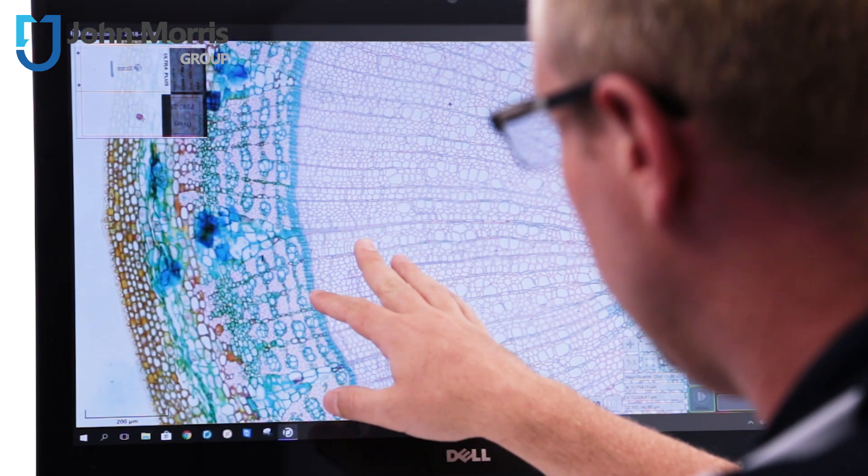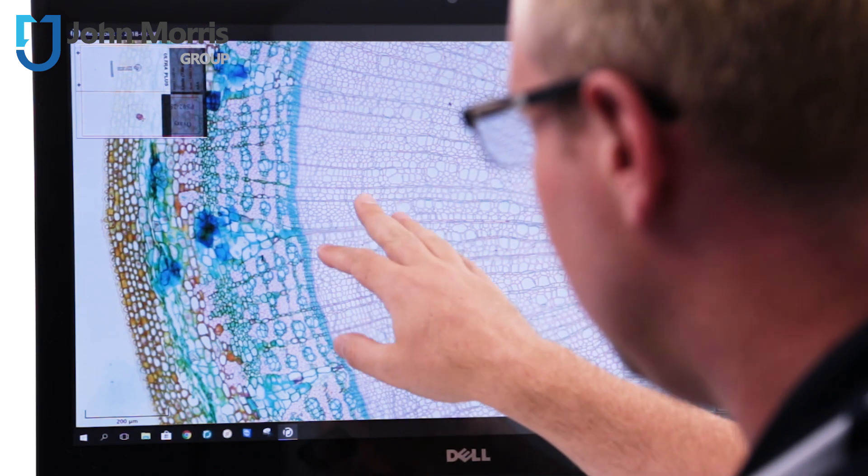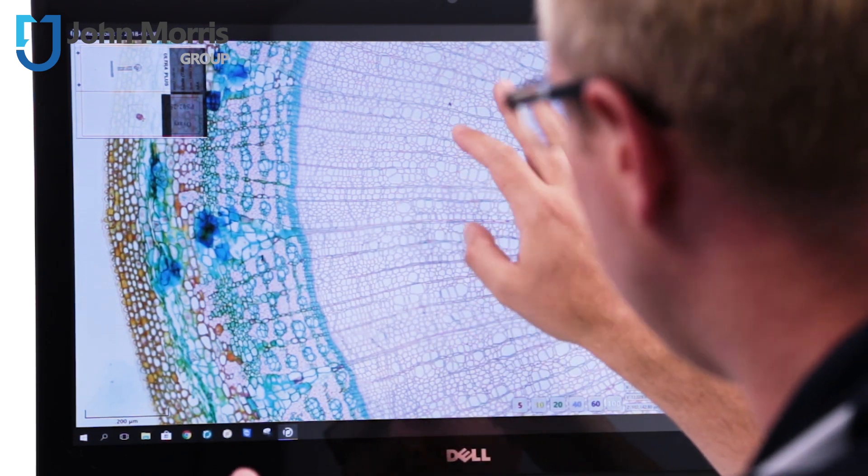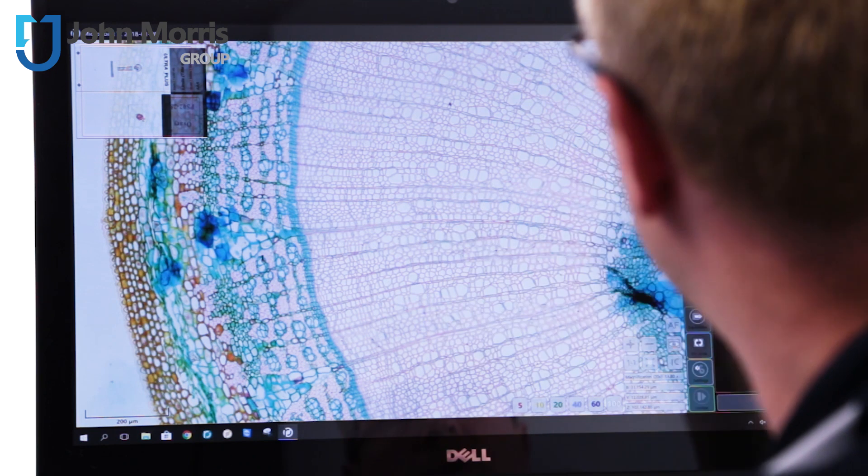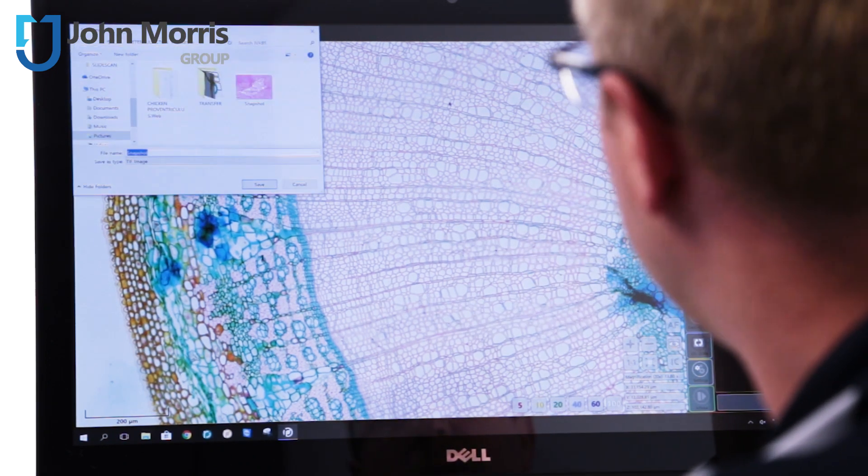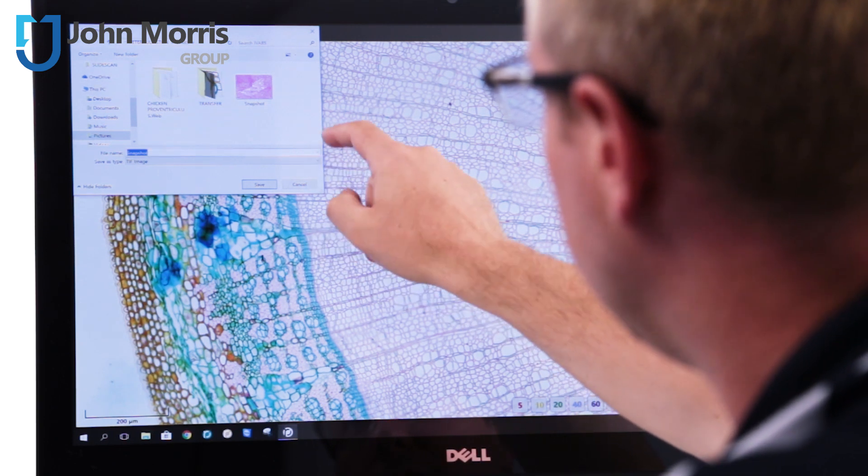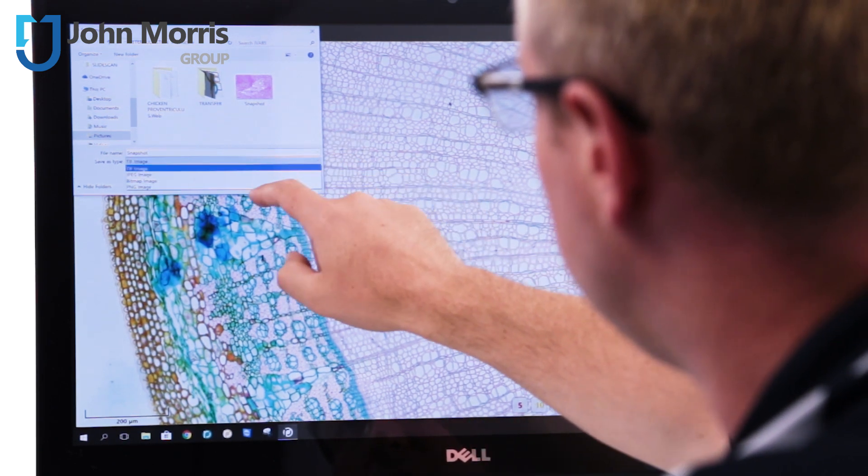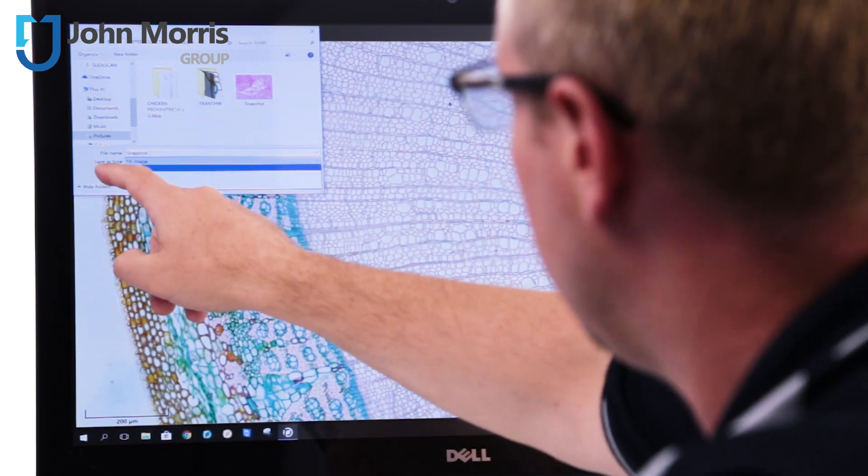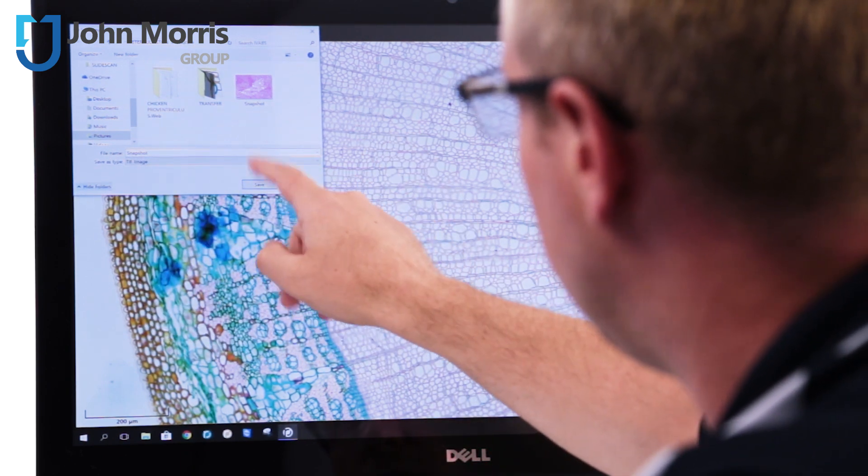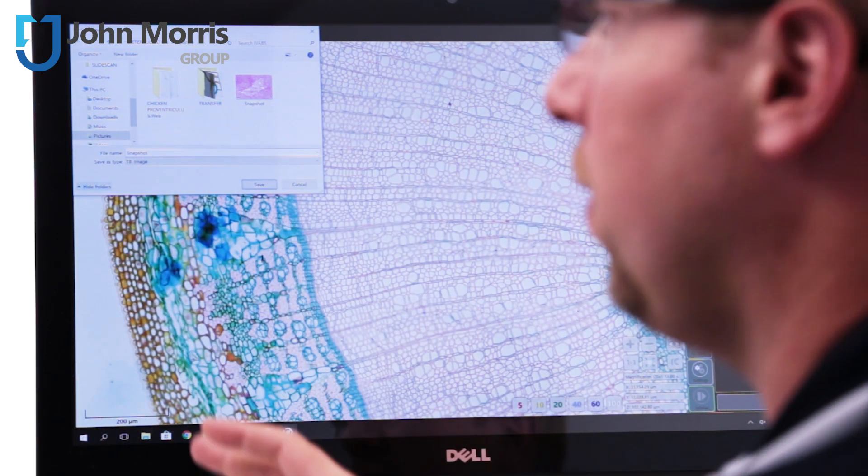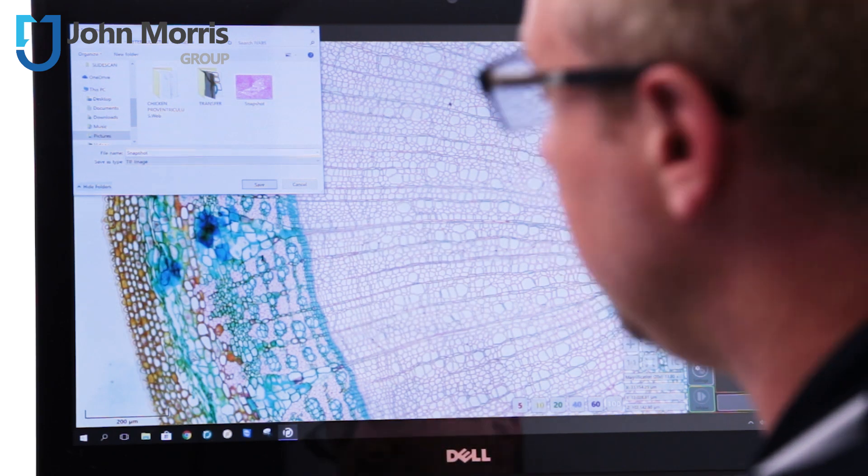So here in microscope mode if I wanted to take a copy of this exact screenshot and send this to somebody else that I'm working with, I can just push this button right over here, take a snapshot, call it whatever I like. I can save that as a TIFF image or a JPEG or a bitmap, whatever is convenient. Push save and then email that file directly over to my collaboration partners.